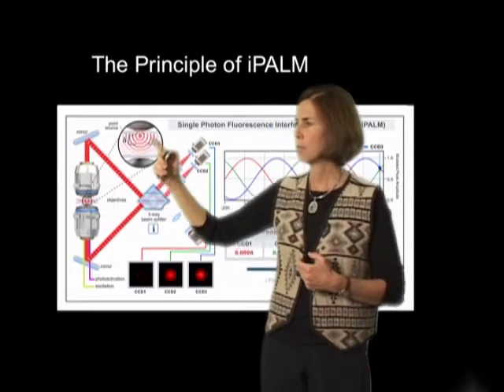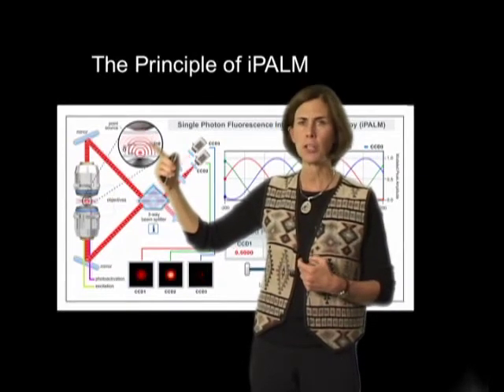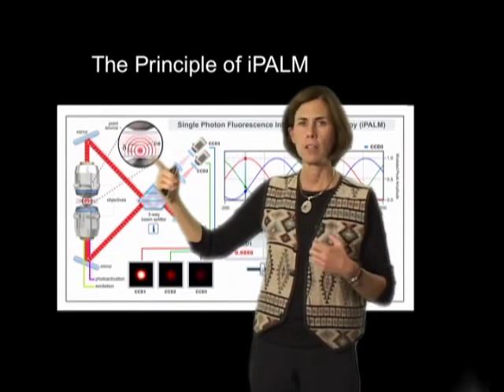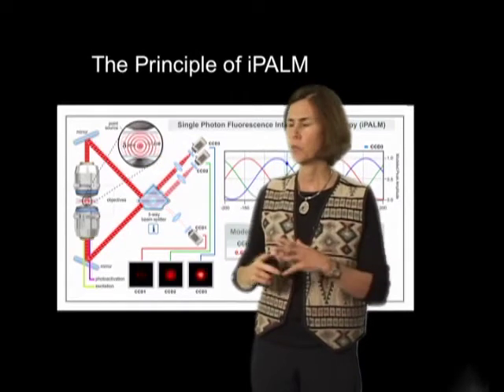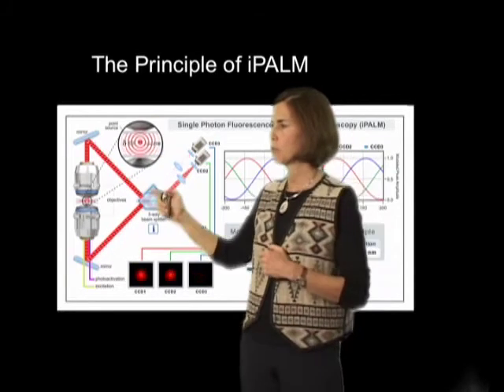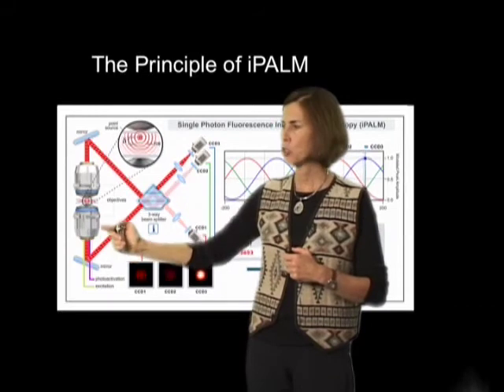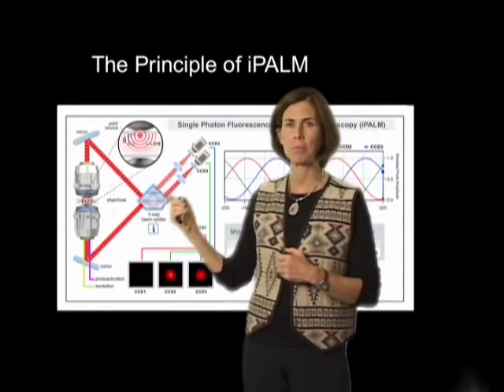And if you zoom up in here, what you can see is an individual photoactivated molecule that's giving off a photon. Now that photon distributes as a wave in 360 degrees, and it's going to move into either the top objective or the bottom objective, and then track through that objective into this three-way beam splitter.